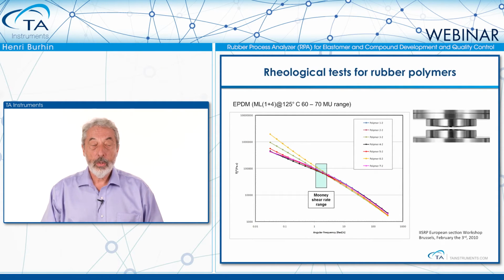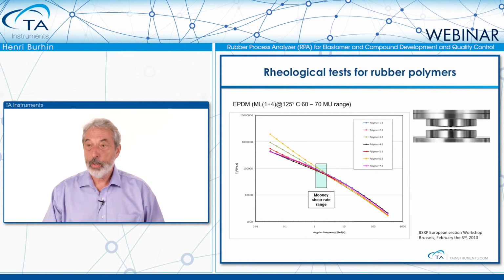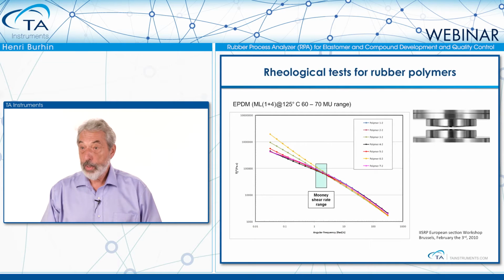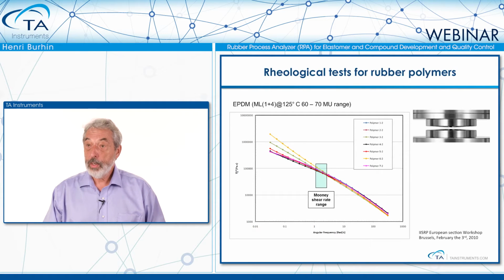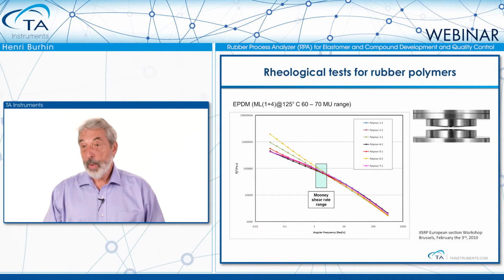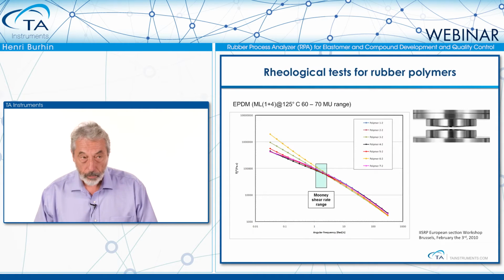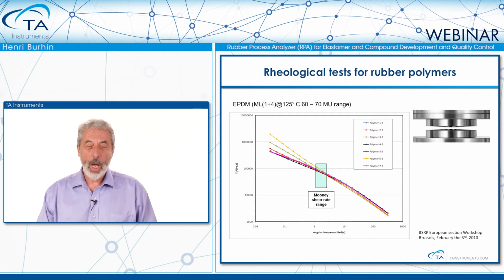The suppliers have some slightly different polymerization processes, and we can see that, first of all, the viscosity curves versus frequency are crossing, meaning they have about the same viscosity at the same shear rate as the Mooney. And this is expectable since they are all from the same Mooney family. But we can see that at high frequency, and especially at low frequency, the polymers are largely different.